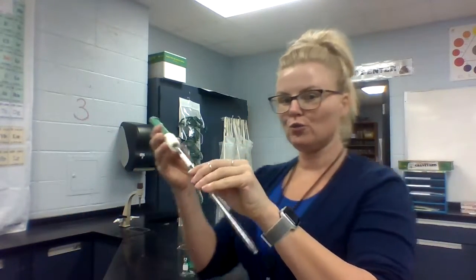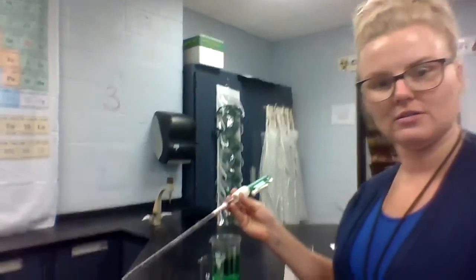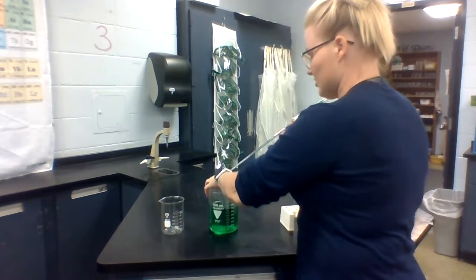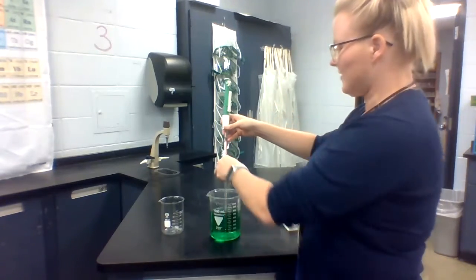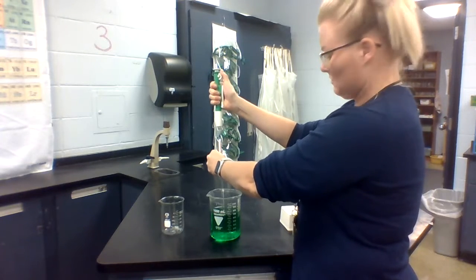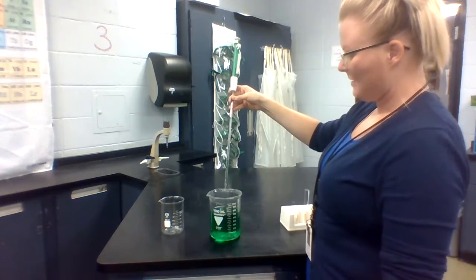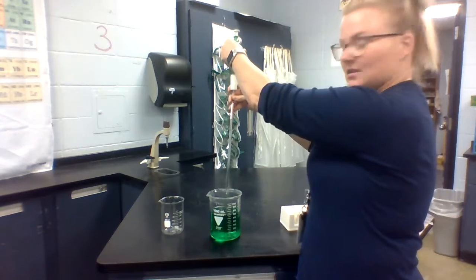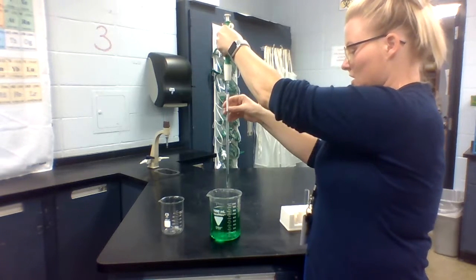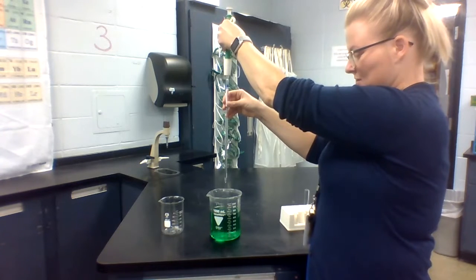Now you are going to draw up your solution. When you do this the first time, you are just going to roll down with your thumb. I have just drawn up a little bit and I am going to go ahead now and depress to release the liquid.